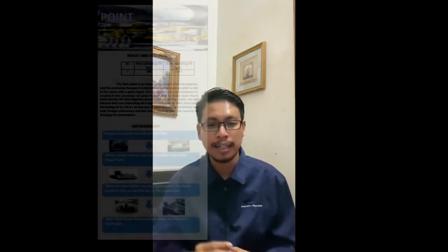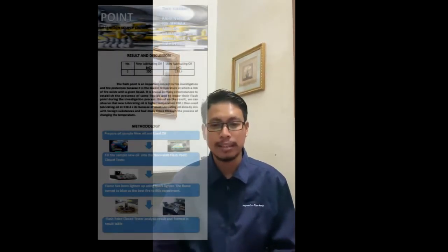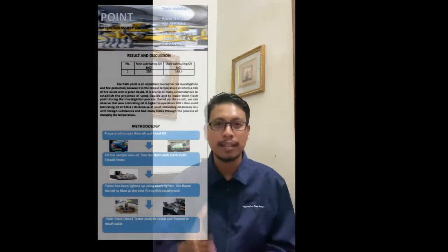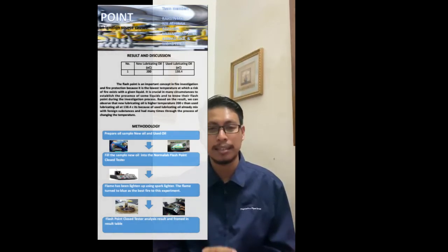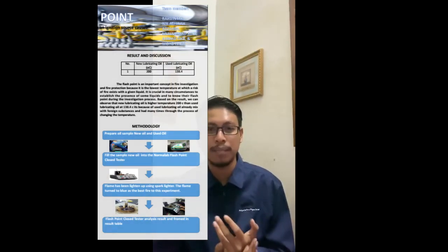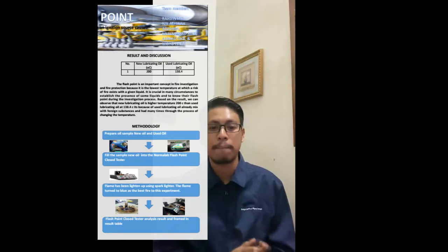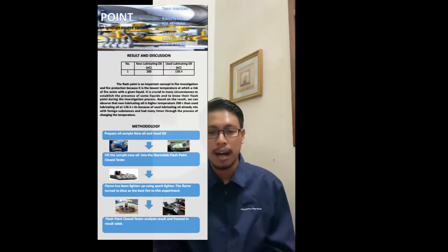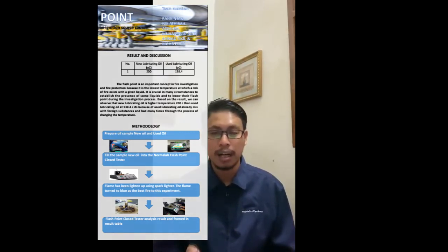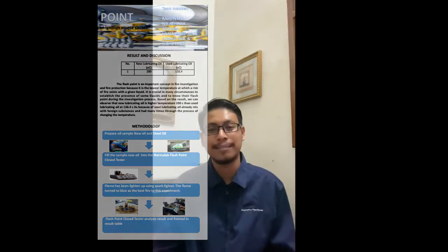The first step is to fill the cup with the oil specimen to be tested until it reaches the exact line inside the cup. Next, the test cover is placed on the test cup with the connection extension or flexible shaft to assemble the apparatus completely. The digital thermometer wire is placed into the temperature slot to take readings right after starting the experiment.